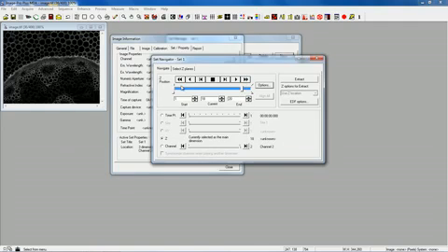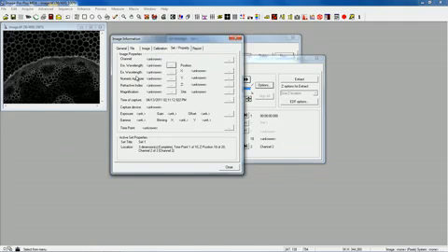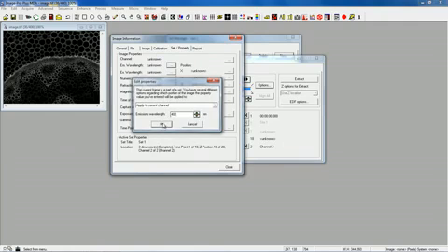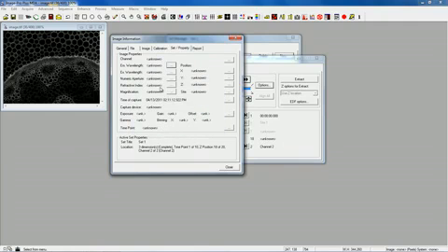And then I switch to a different channel, and I enter a value for that. So maybe I make that one 400. And I can set up the magnification, the refractive index.